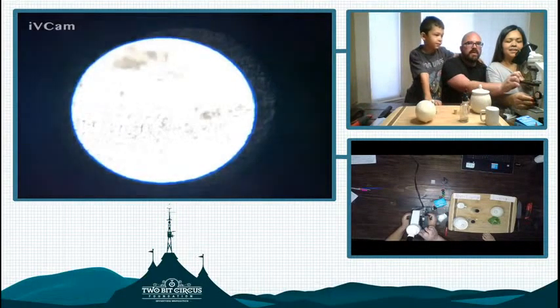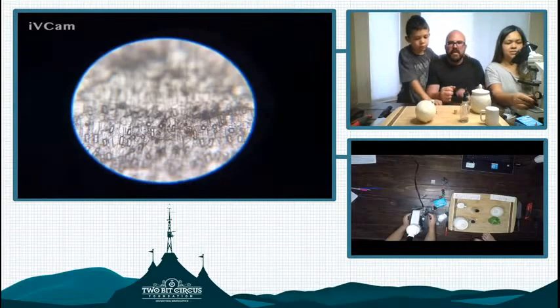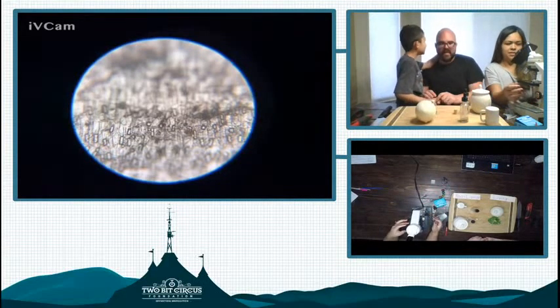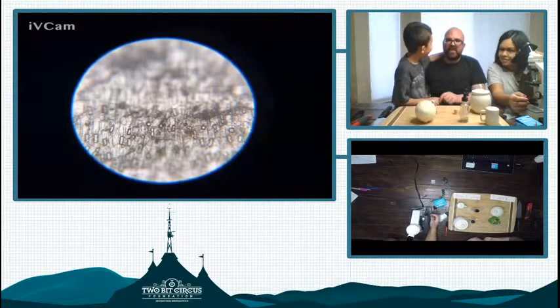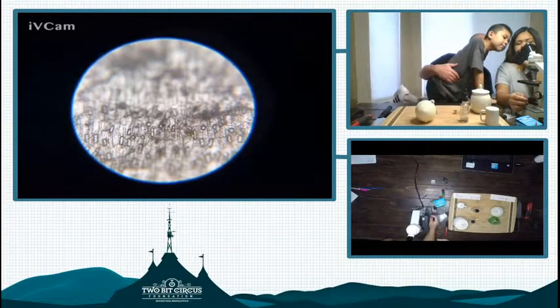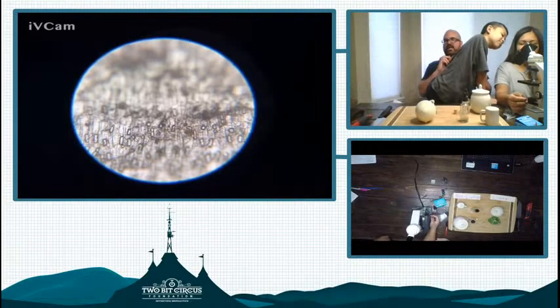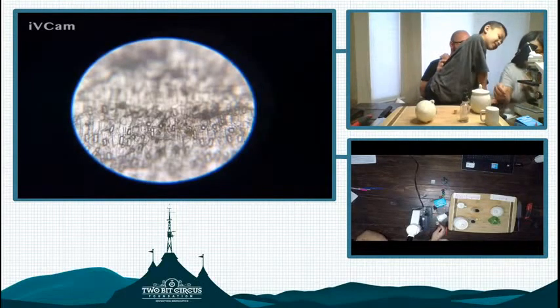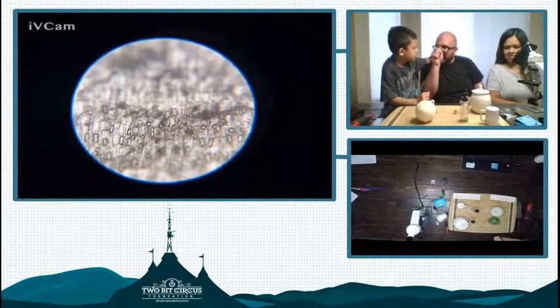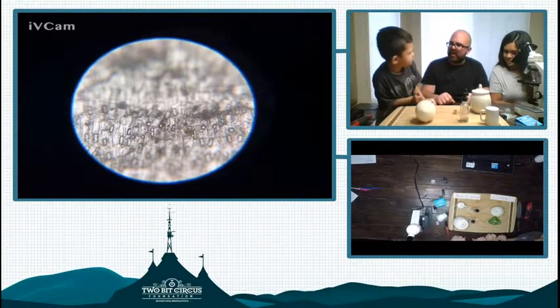Okay. And like Michael mentioned earlier, it's not a flat sample, so we don't have just one plane we're trying to focus on. It's like multiple planes. So we start to see something, right? Robert, start to look. Do you see something? Can you see on that screen there? What do you see? Little rectangles. You see like little tiny rectangles there, huh? It looks like rocks. Okay, they kind of look like rocks, right? But you see a pattern in there, don't you? A pattern of a bunch of little tiny rectangles that are touching each other, huh? And what do you think those little tiny rectangles are?